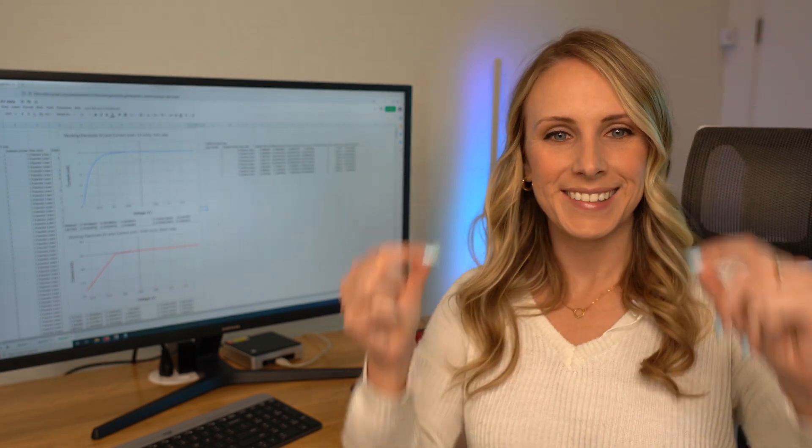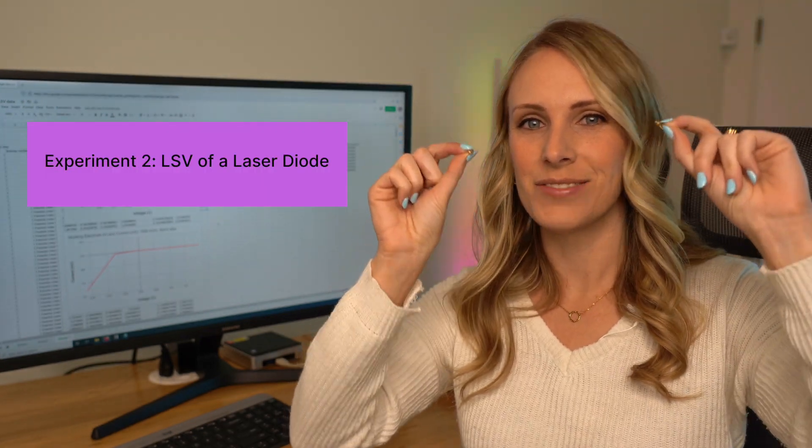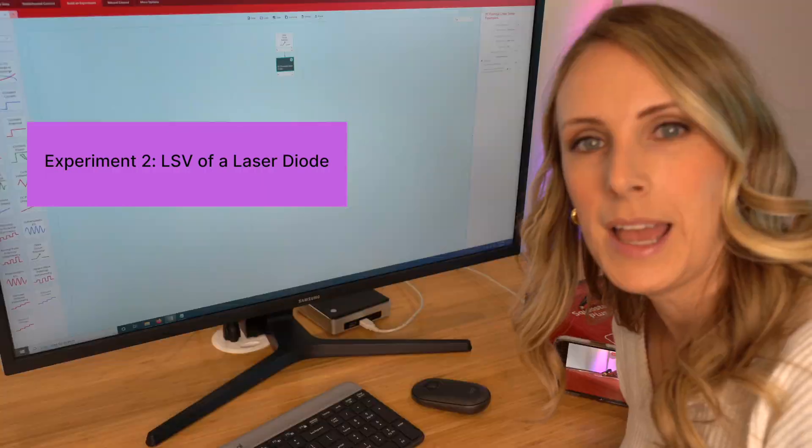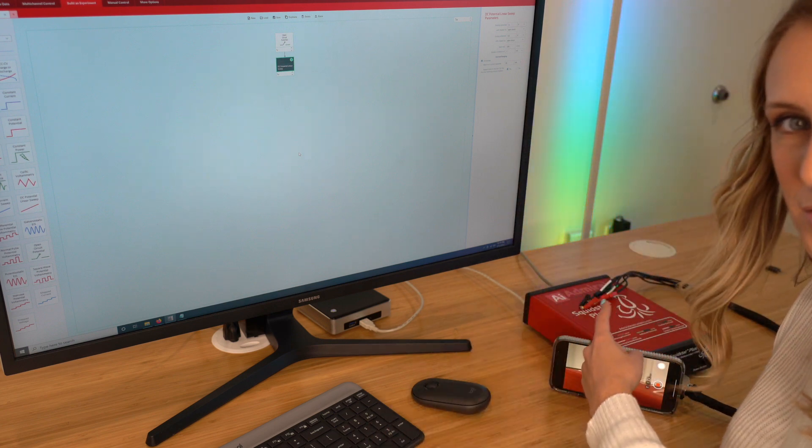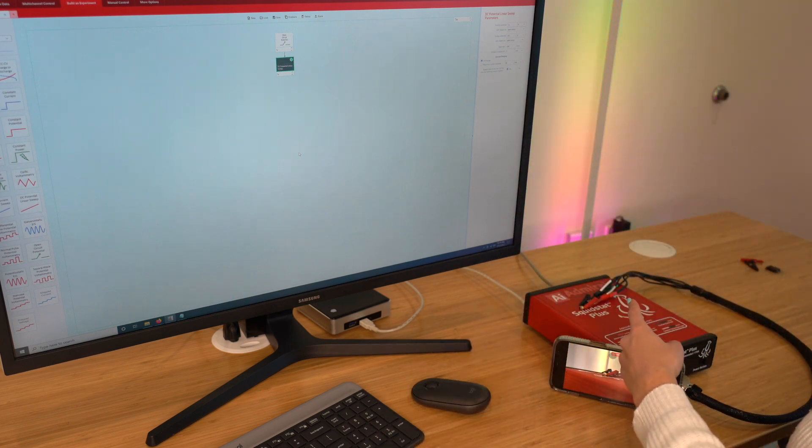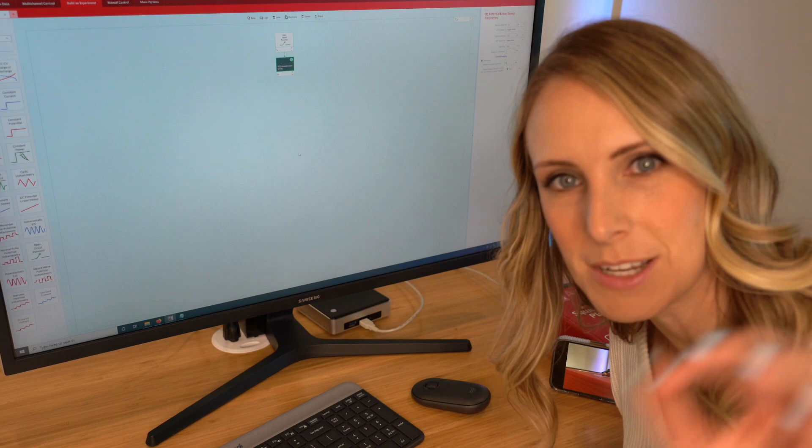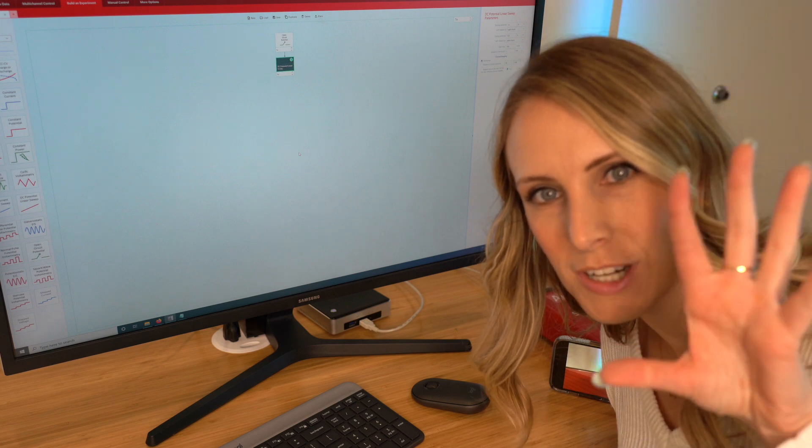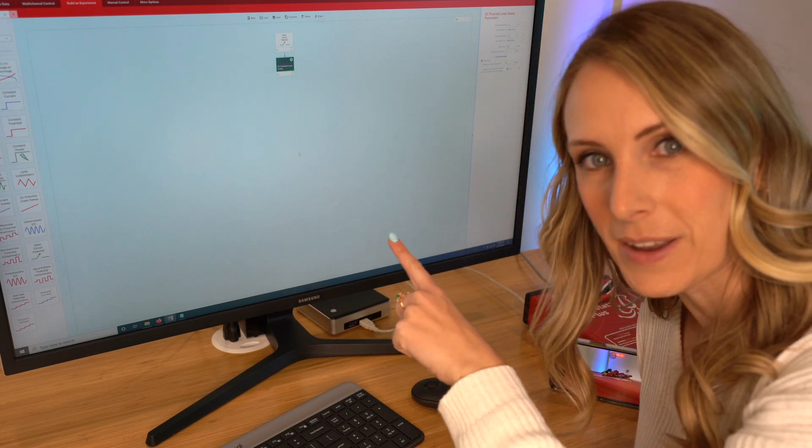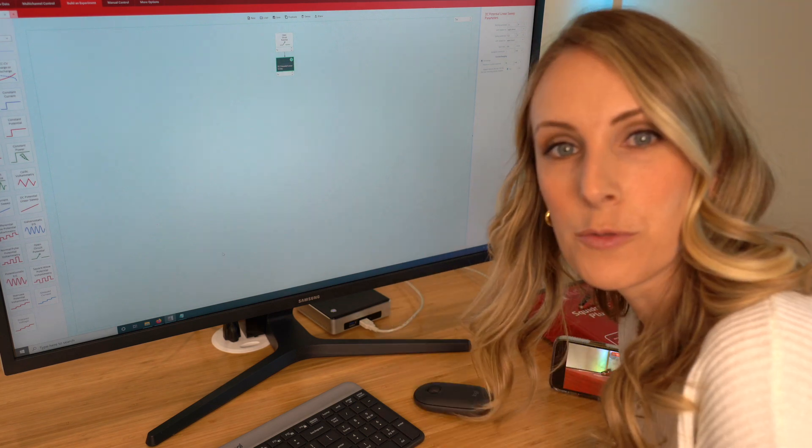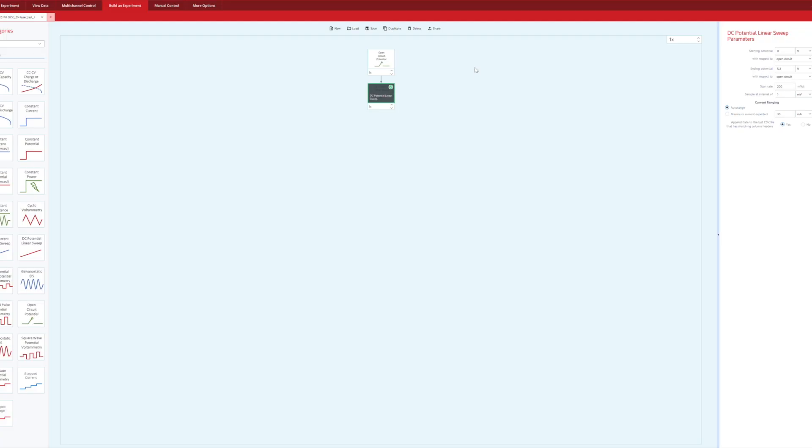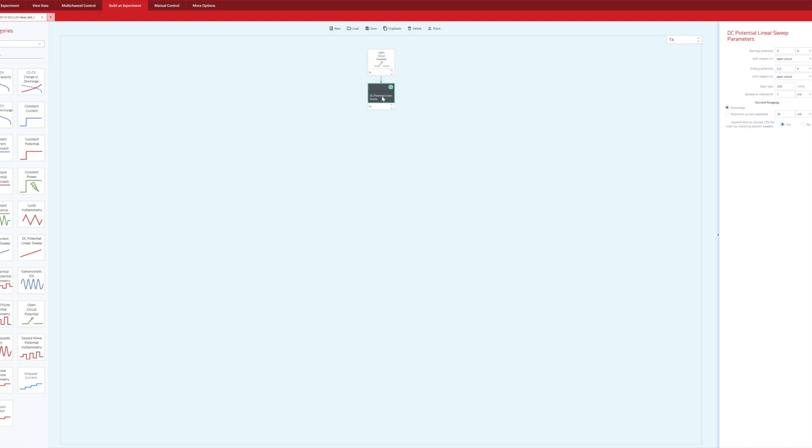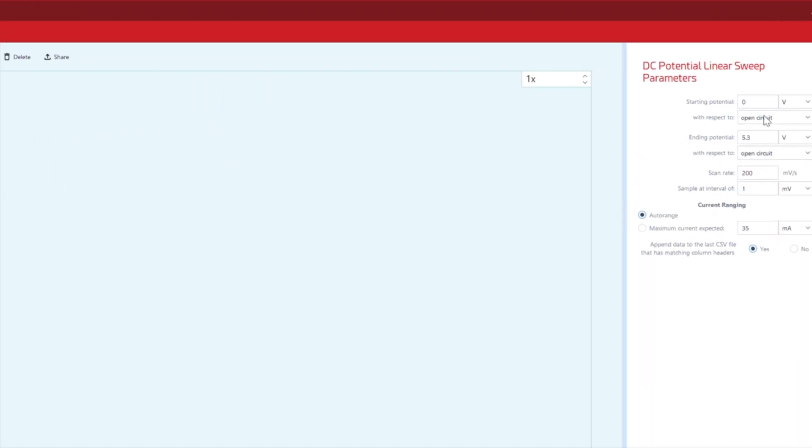Now for fun, let's light up these laser diodes using LSV. Now it's time to try out our laser. I have it wired to the potentiostat and then I have my camera recording the laser to see when it actually shines and lases and then I'm going to lead you through the interface here. First, let's set up the experiment. You can see I have a block diagram of first a measure of open circuit potential for a second and then a DC potential linear sweep, that LSV from 0 volts to 5.3 volts at a scan rate of 200 millivolts per second and a sampling interval of 1 millivolt. So let's start this experiment.